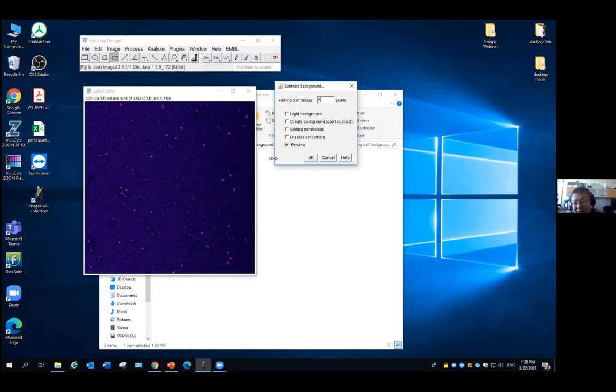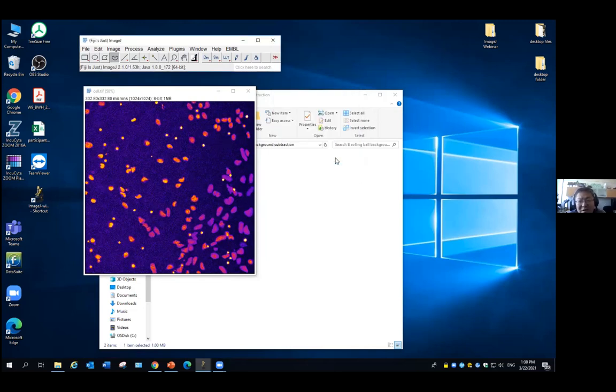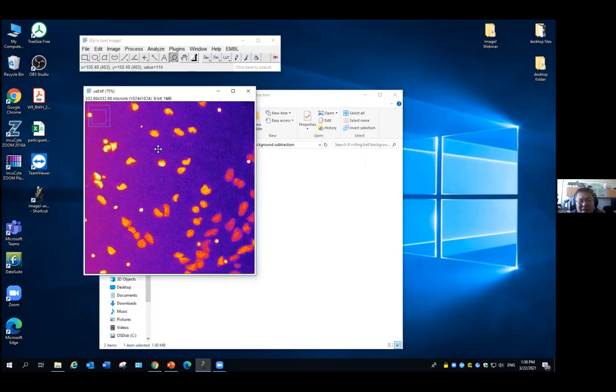They consider the cell has certain sides where the intensity is kind of smooth inside the cell. They will consider that part is also background. It began to cut. So generally, that's what kind of size you put in here. I normally try to put it a little bit larger. And the rule on this is you go through here, you try to find what is the maximum size.